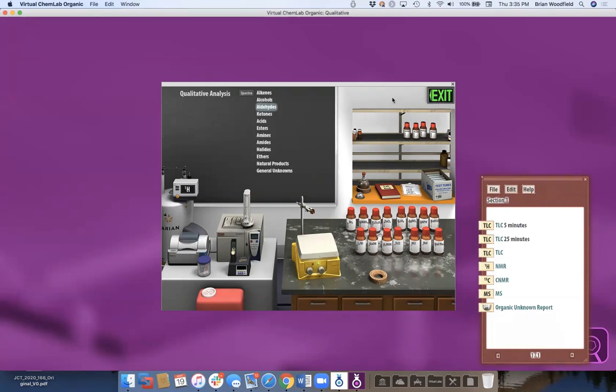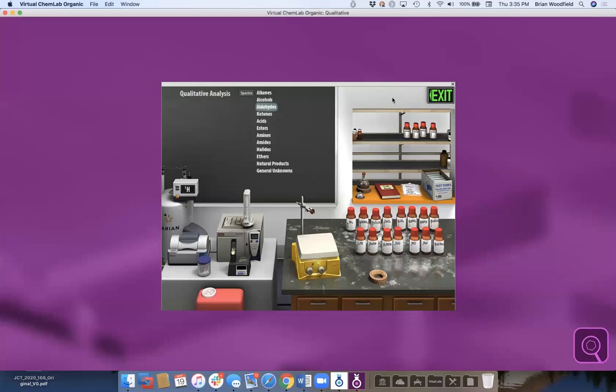And you can certainly require students to write a lot more of the notes or even answers to questions in whatever assignment you're giving them in that notebook. So you can maintain it as a lab notebook, or you can have them do it separately with whatever type of worksheet, either ours or your own, that you would do along with it. So that lab notebook we see as a way for a student to explain their procedure, explain what they observed, and then they can submit that to you.